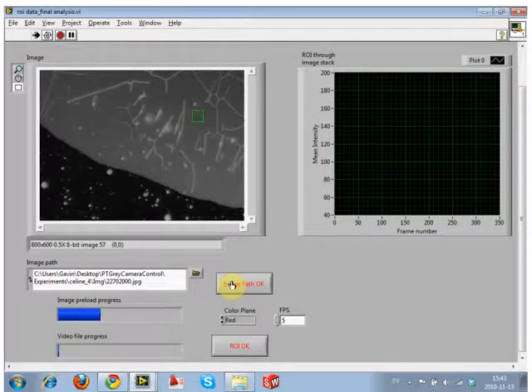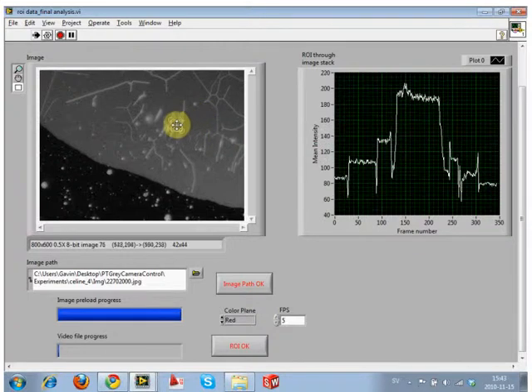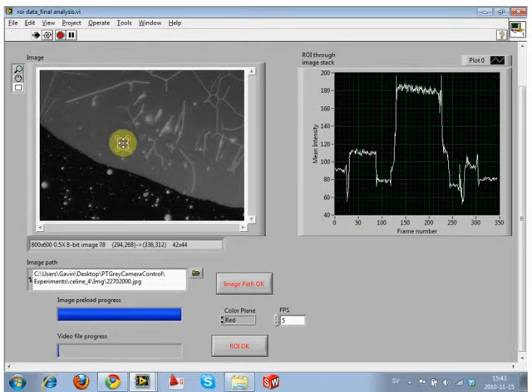So if you're actually using it right now, this is ticking along. It's doing the preload, but at the same time as preloading all the images, it's remaking all of the images. It's totally not necessary for most people. It's just sometimes it's good to have your data set cleaned up, because we're having to open all the images anyway. We might as well clean them up and structure their file names and everything as we want them, because we're already doing half of the work, so we might as well finish it off. So, as before, we've got this real-time analysis thing.